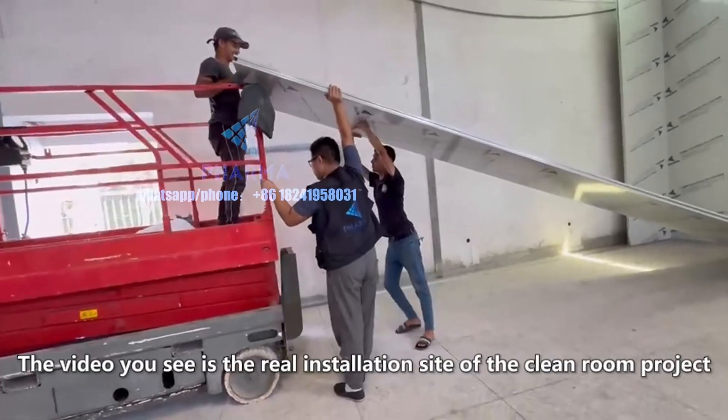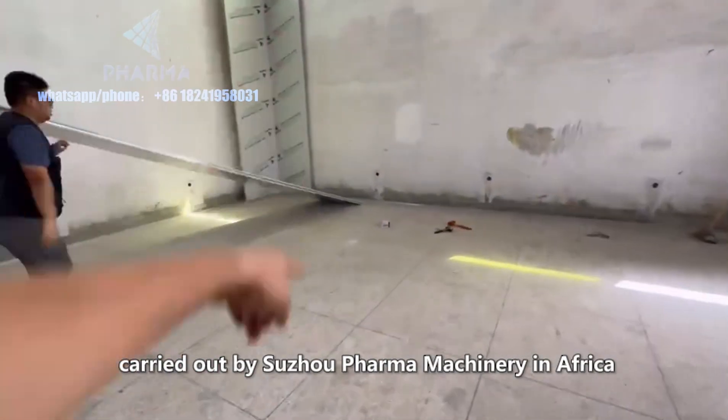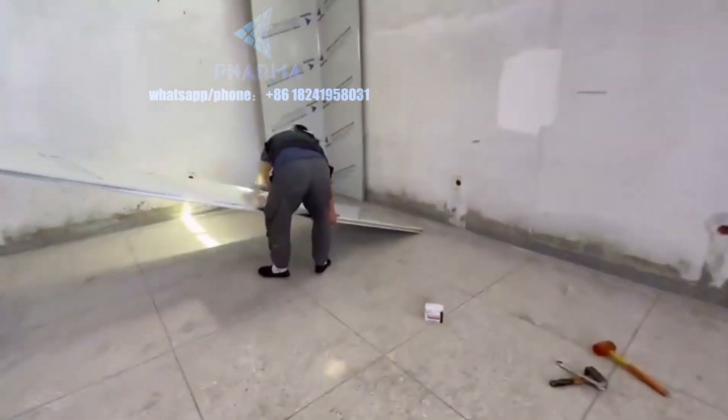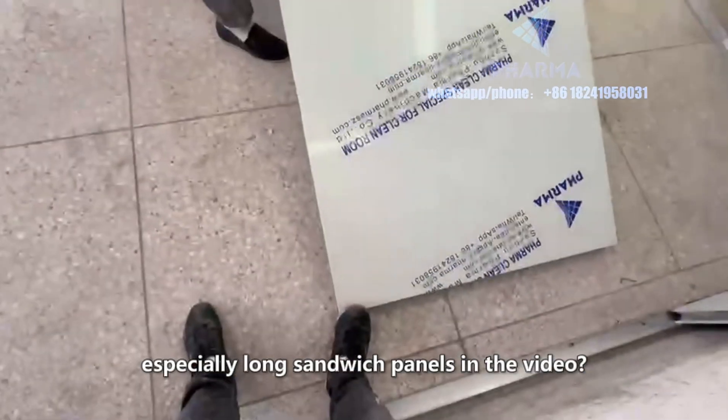The video you see is the real installation site of the clean room project carried out by Sujo Pharma Machinery in Africa. A lot of people are wondering how to install wall panels, especially long sandwich panels, as shown in the video.